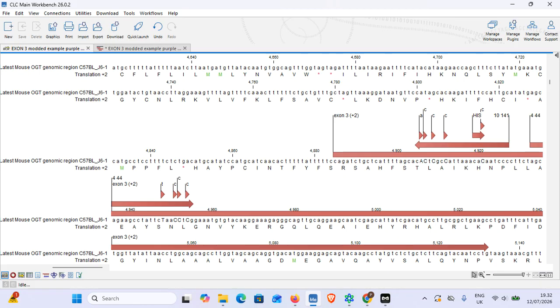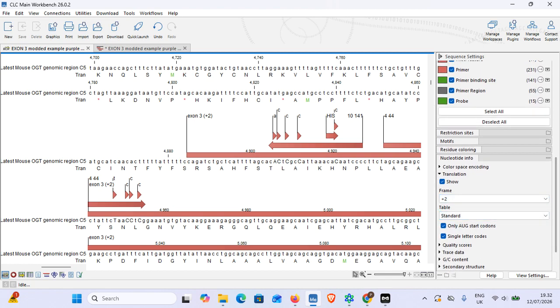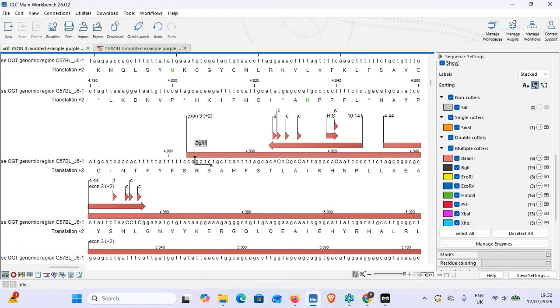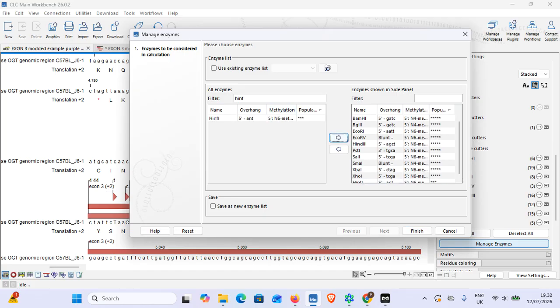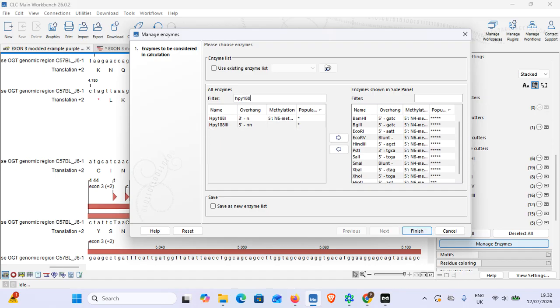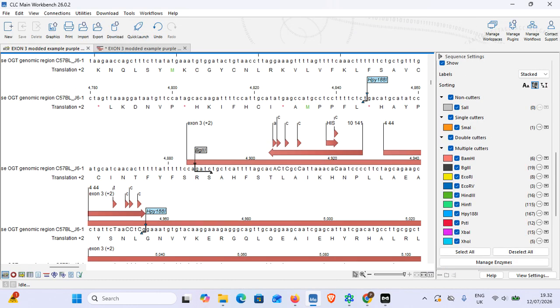Okay, so here we are. I bring up the restriction site menu and just check that there's no spontaneous occurrence of those restriction sites, because that would really be tiresome. What can you do? So let's see. HINF1 is an easy one. Like I said, it's practically a member of the family. Boop, in you go. And HPY188. Oh, I'll choose I rather than III. Okay, and finish. And what do we have?